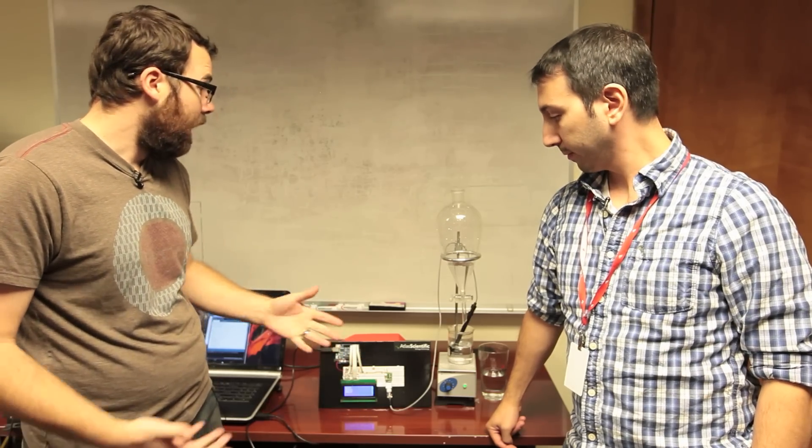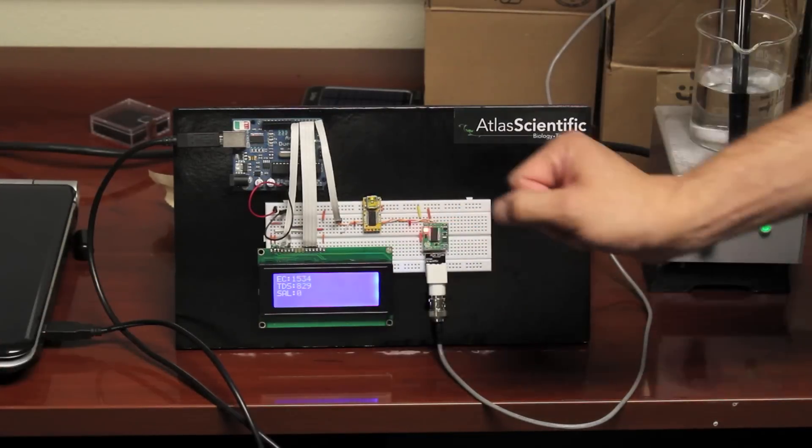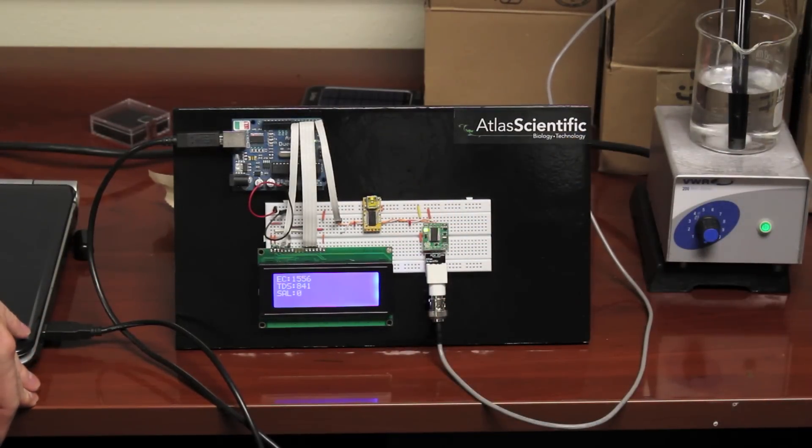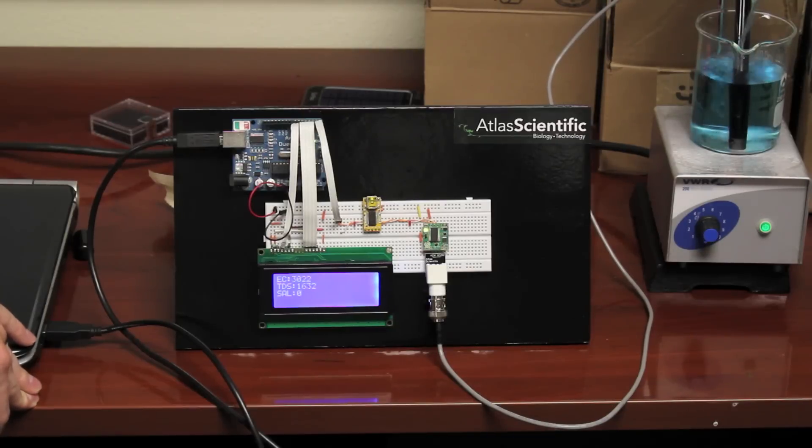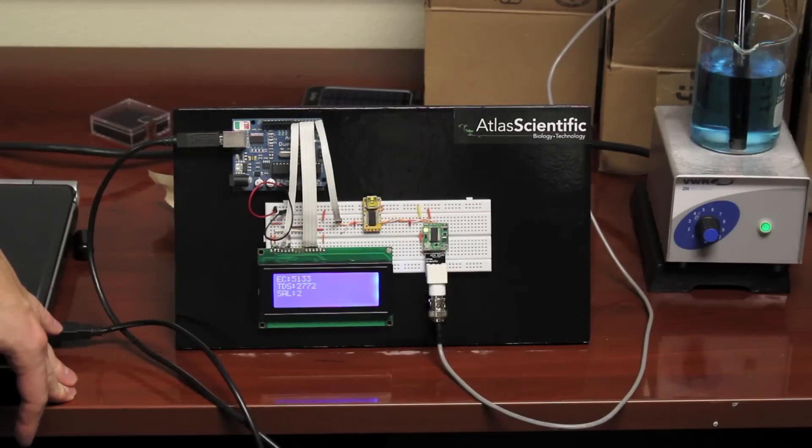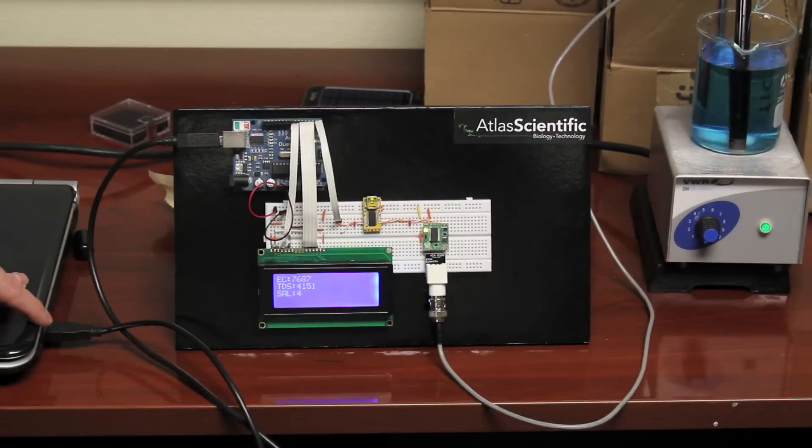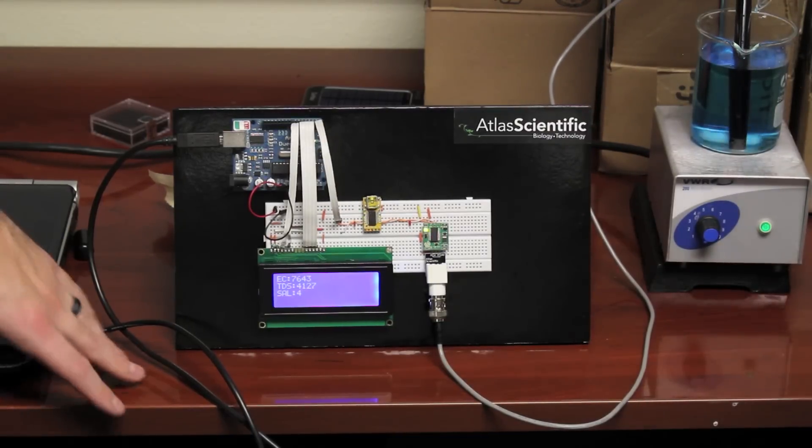So here we've got pretty much the same looking setup, but we've changed out the probes and changed out the electronics. And now we're going to be testing electrical conductivity, correct? You can see we put some salt in the water to give it a baseline. And by adding just blue salty water, you'll start to see the conductivity starts to rise quite rapidly. Along with the dissolved solids too. And then you see as it goes, the salinity starts going up. It reads the salinity in the water, it reads the conductivity, and it gives you a simple string of already compiled information.